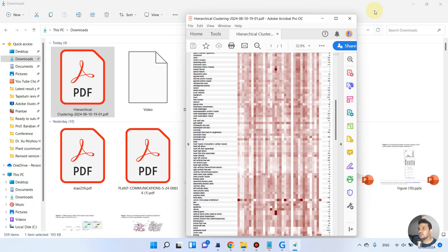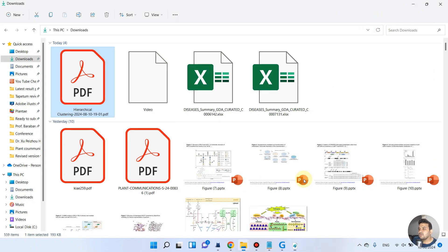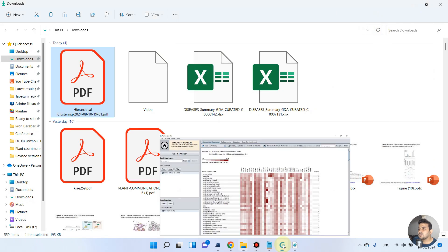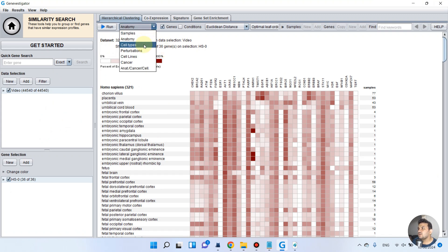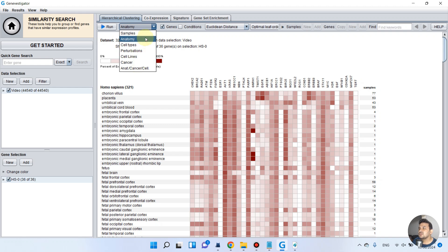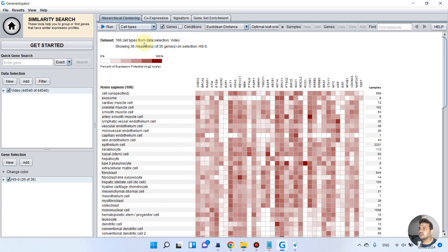Now we can go back to the Gene Investigator tool. If you want to change the view based on cell types, perturbations, cell lines, cancer, or others, you can switch between anatomy and cell types — as you can see it switches easily.